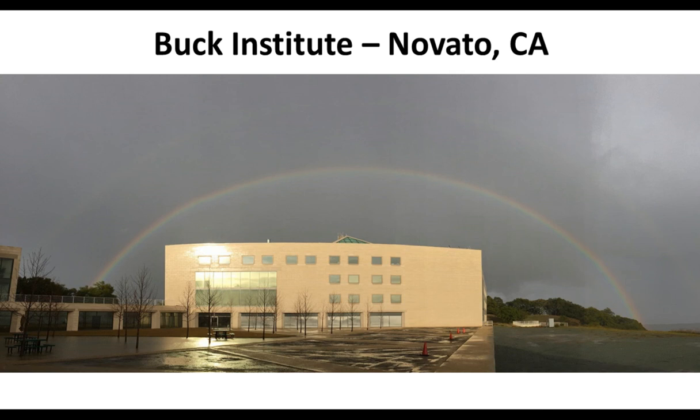But what I was saying is, if one really wants to specialize on the site localization, I do think that maybe the DIA has some advantages because of the comprehensiveness and the ability not to lose very minor isomers that may be present. So in our lab, we have shifted a little bit more toward the DIA approaches. That's just the preference in our lab.